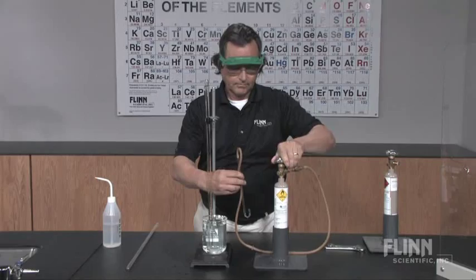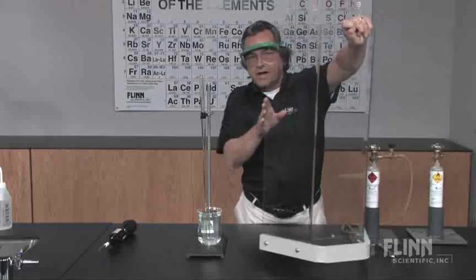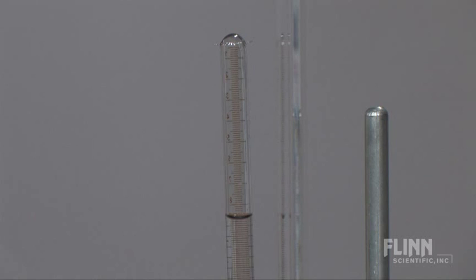For safety, place a safety shield in front of the tube and make sure that students are wearing safety glasses. When ready, touch the tip of a Tesla coil to one of the wires igniting the combustible mixture.